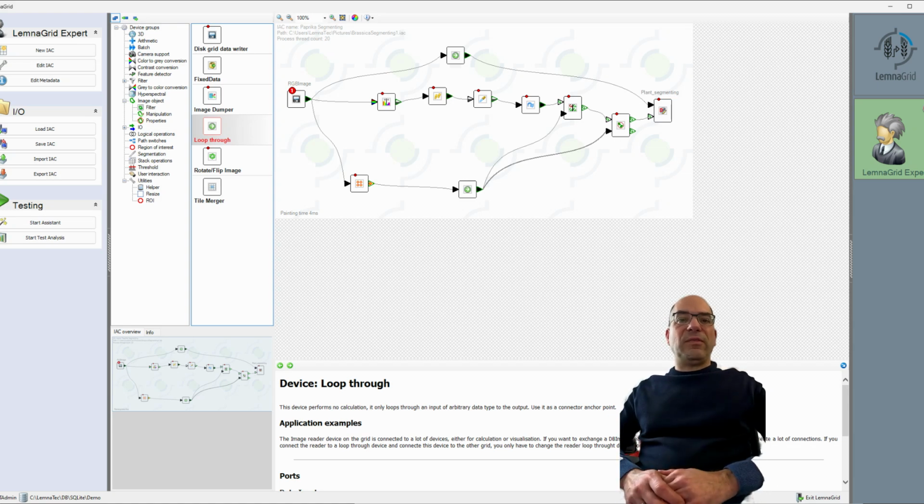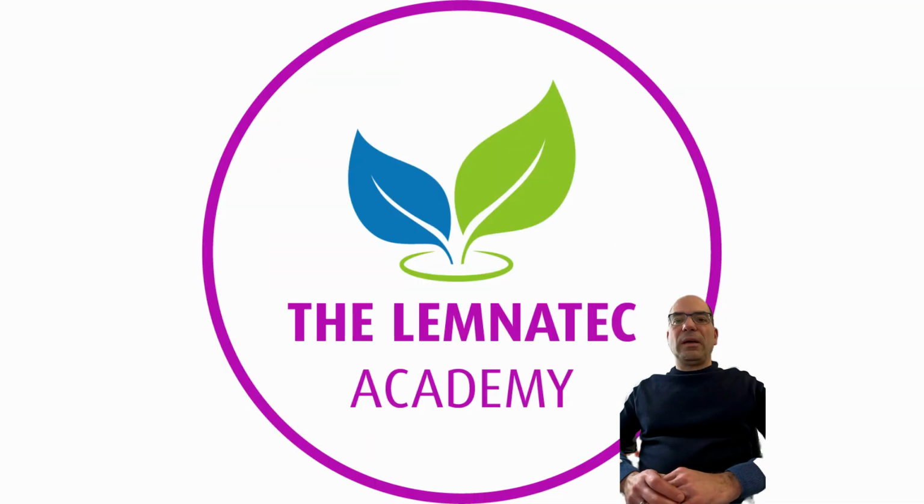These have specific features. They are user programmable. That means you as a user can do the programming even without having skills in code writing.